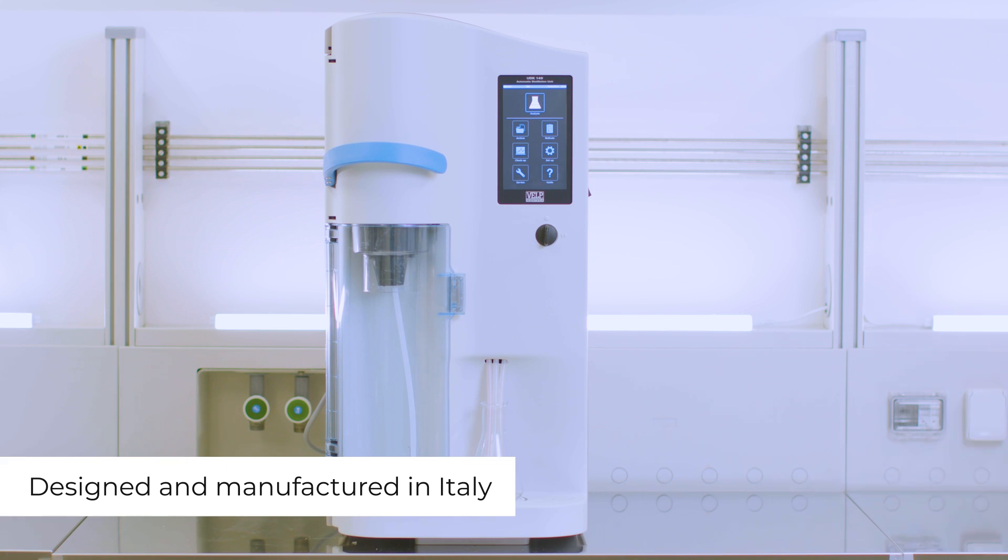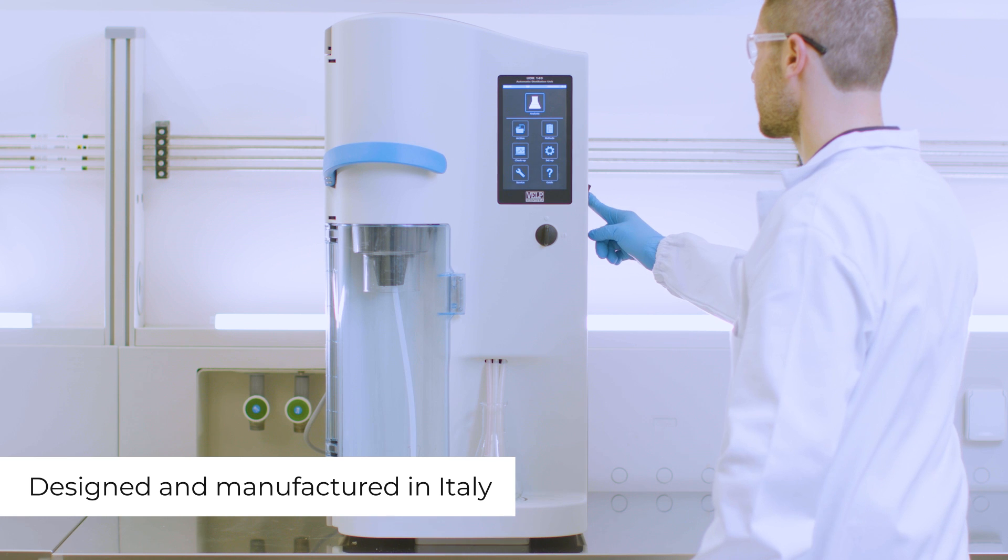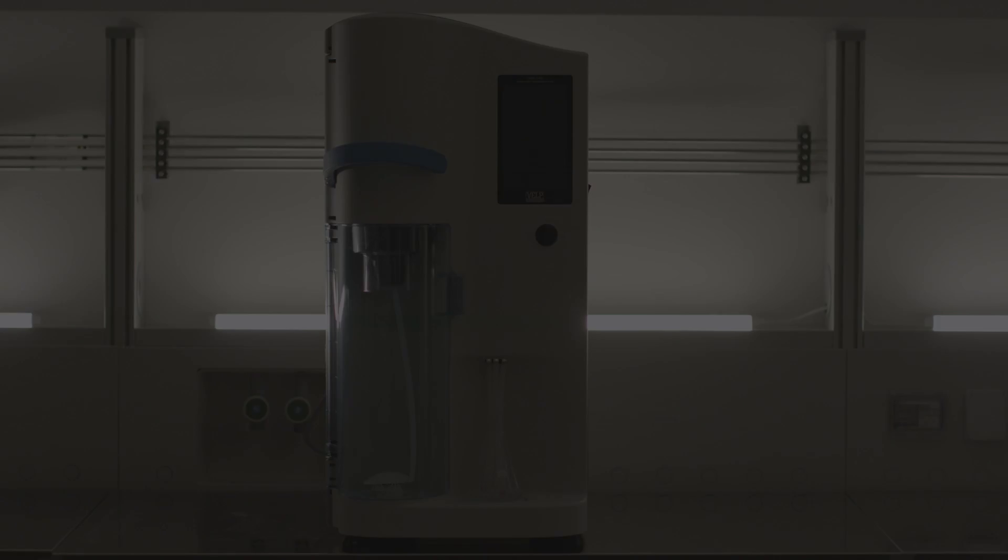VELP UDK 149, the versatile Kjeldahl distillation unit designed just for you.